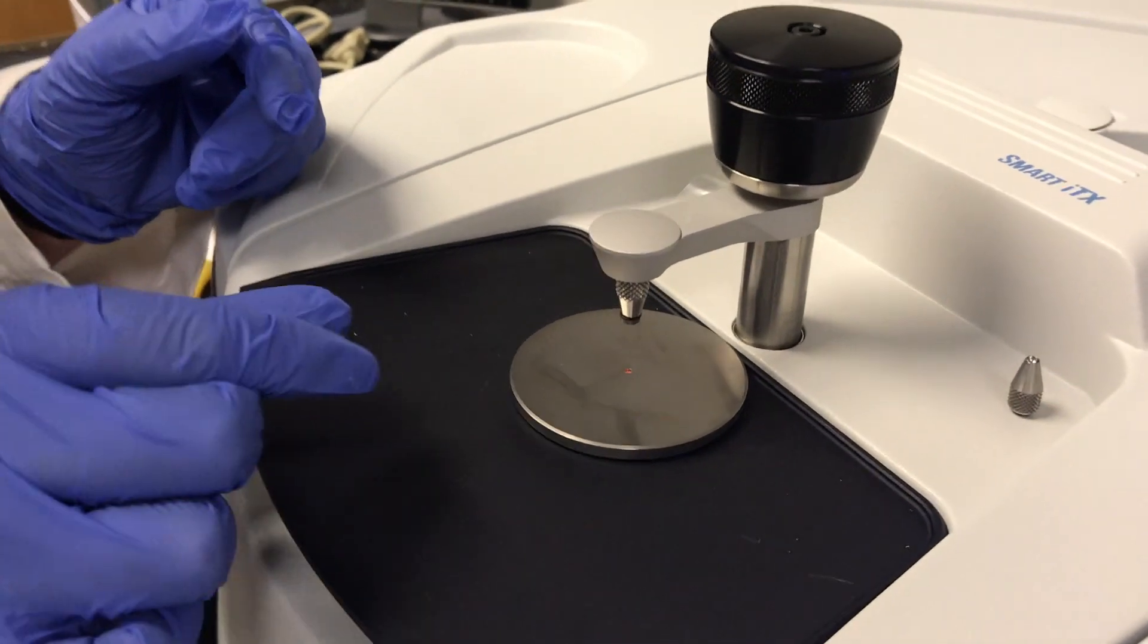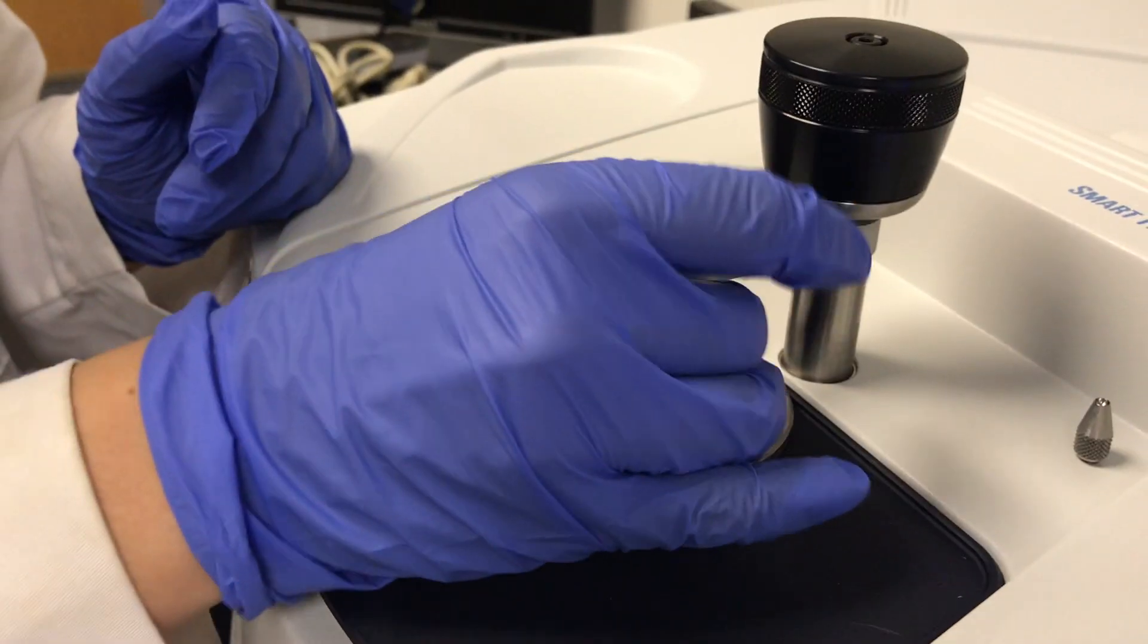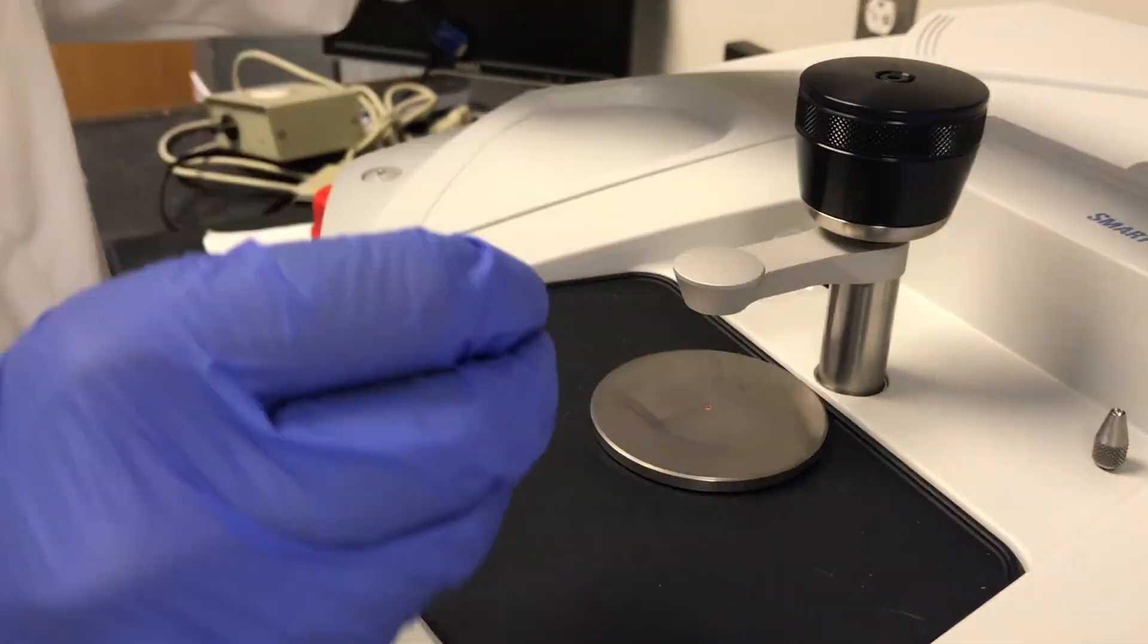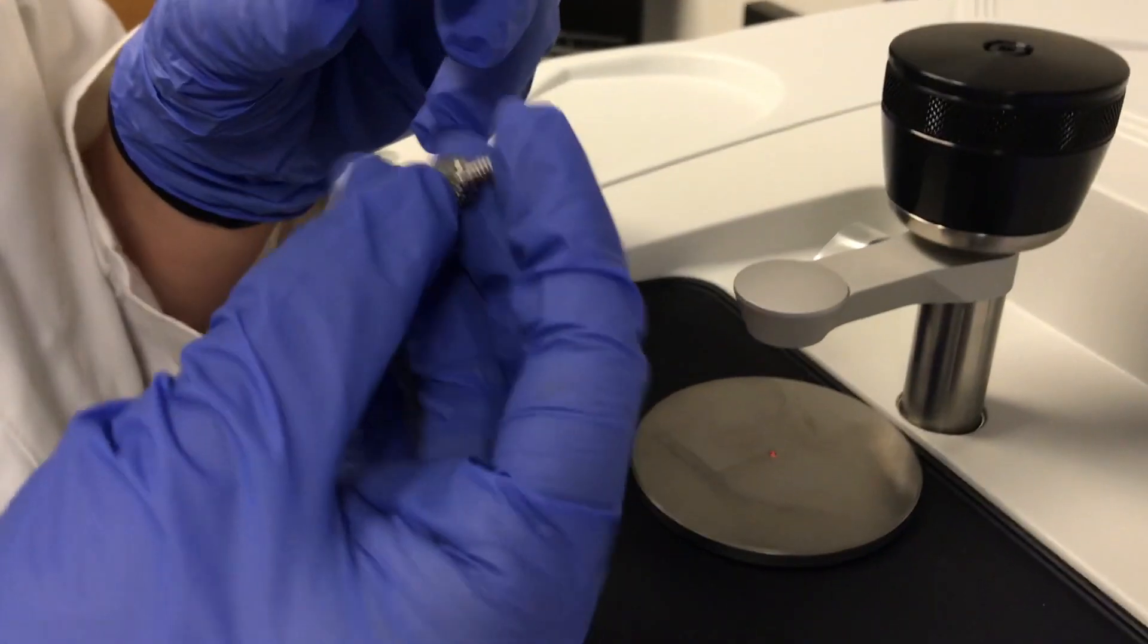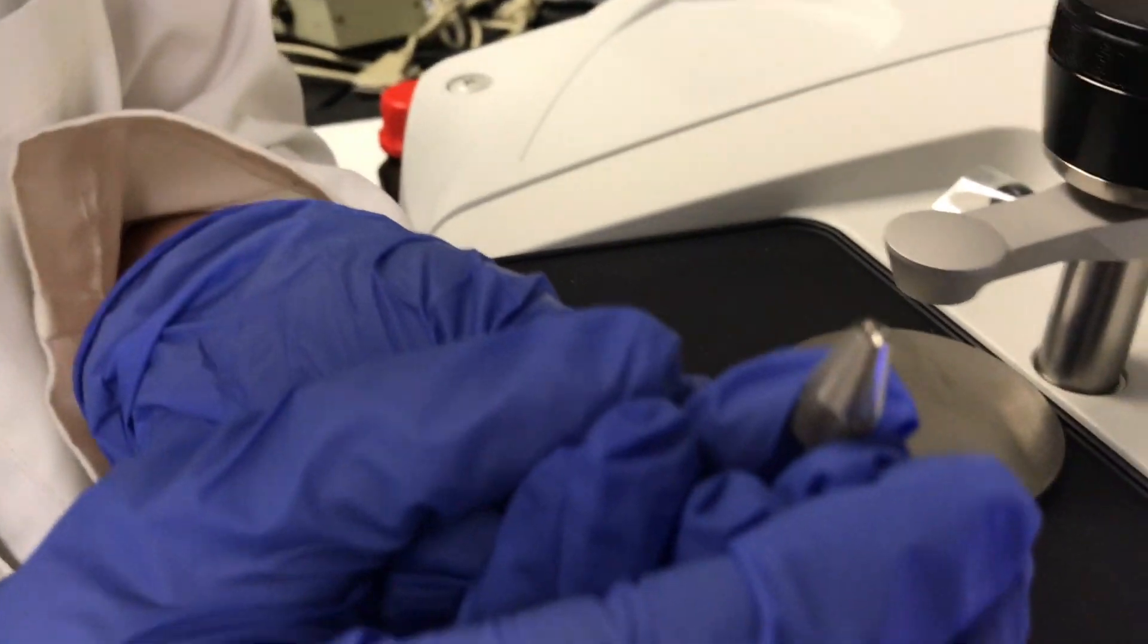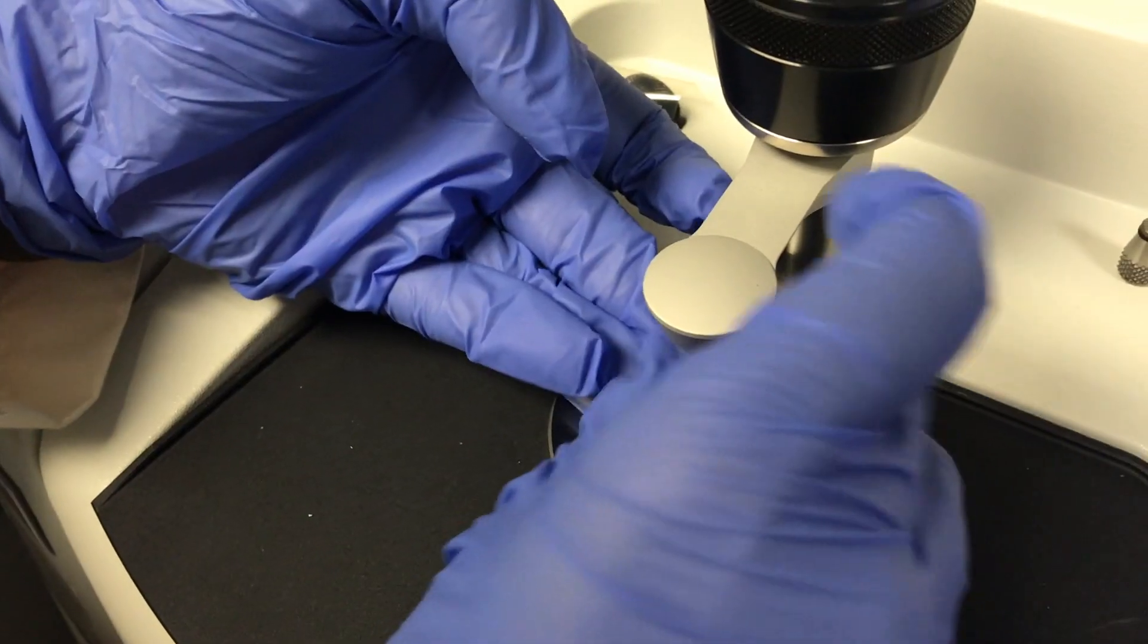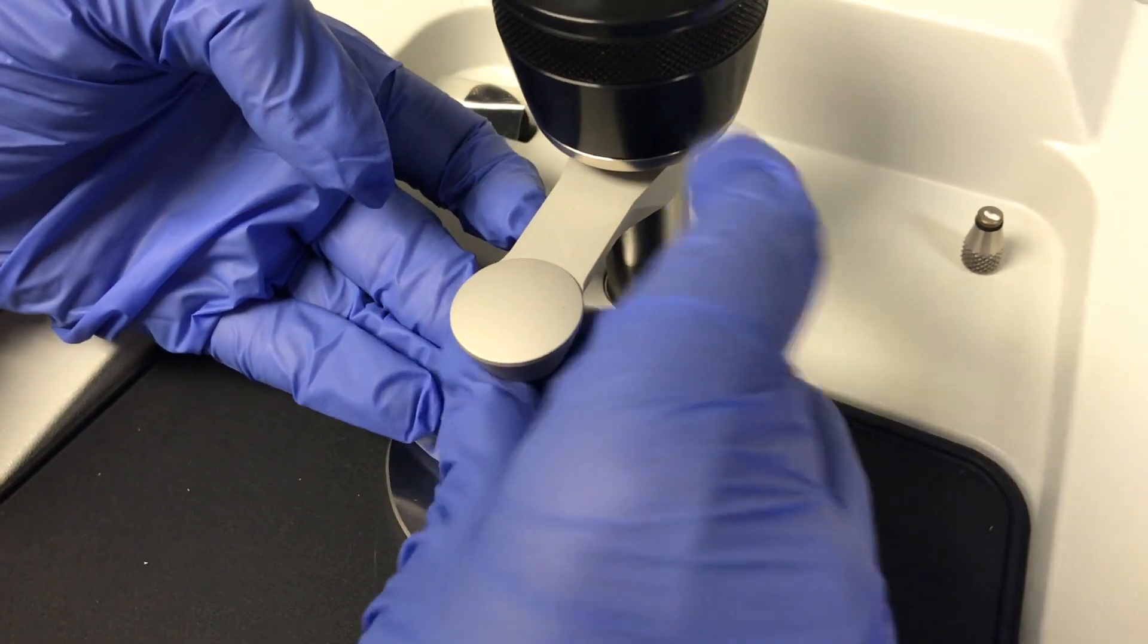Now for the liquid sample, we have to remove the solid sample accessory and put the liquid sample accessory on. This is the liquid sample accessory and you just screw it on and make sure it's on there really tight.